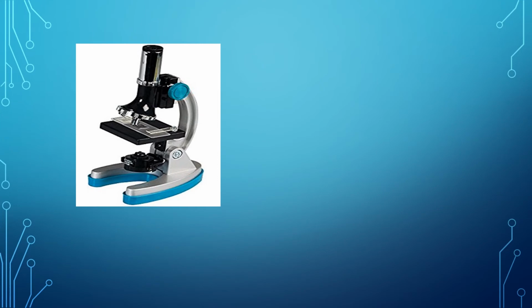Have you ever seen this one? What is the name of this laboratory equipment? It is called microscope. Usually you are going to use this when you are learning biological science. If you are learning about microscopic organisms, then you are going to use this one. What is the function of this microscope?